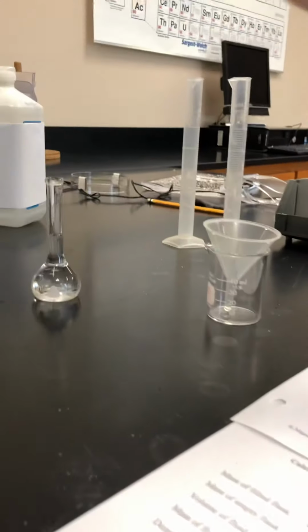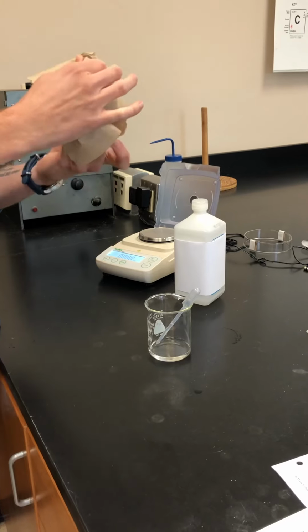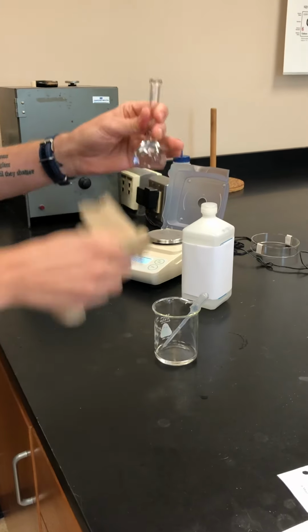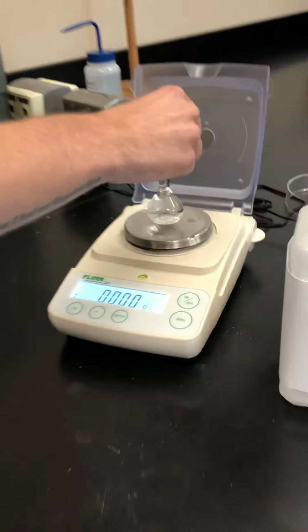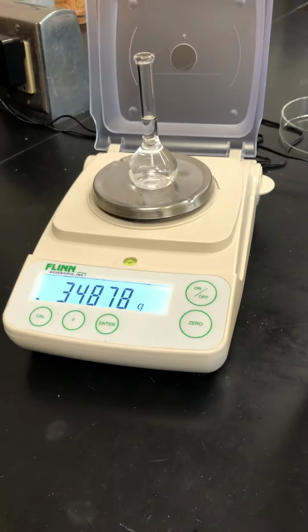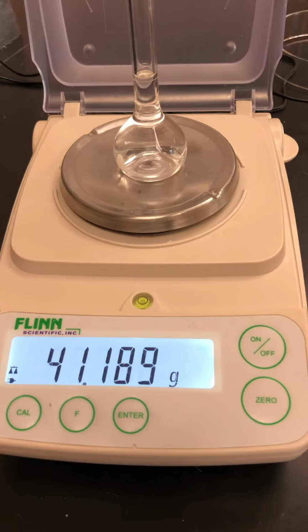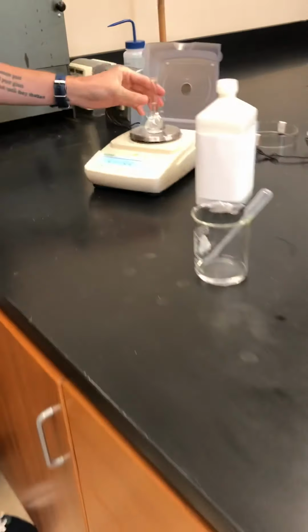Now I'm going to just wipe off the outside to dry it off, just in case I accidentally spilled some on the outside. That way we're only measuring the liquid that's inside the flask. So now we've got it filled. I'm going to put it back on my zeroed balance. And you're going to record this mass as the mass of your flask with your unknown solution in it.